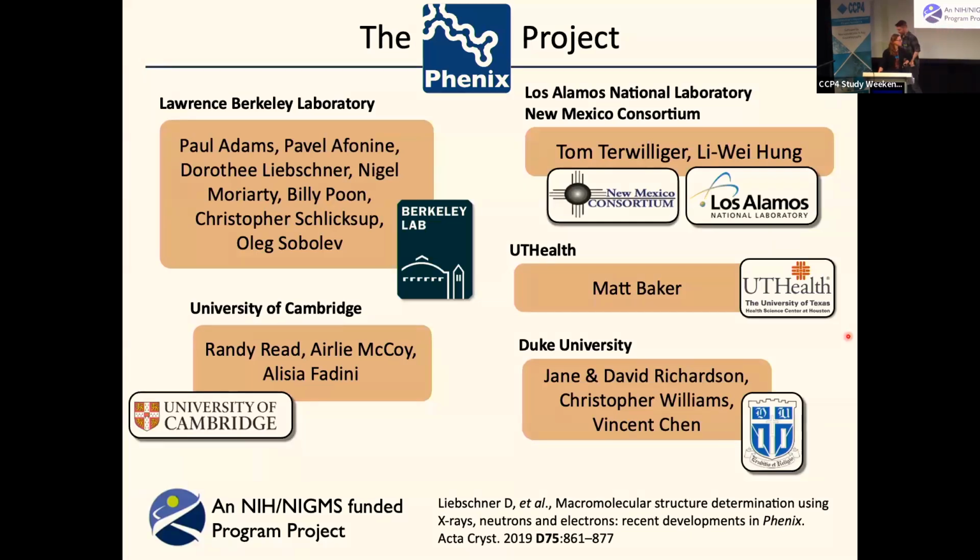Are there common features or characteristics of structures that still fail MR using AlphaFold models? I think one thing that was mentioned in, I don't remember if it's Claudia's or Airlie's paper, is that AlphaFold can still predict helices very well, but there are kinks or some subtleties that are not that great.